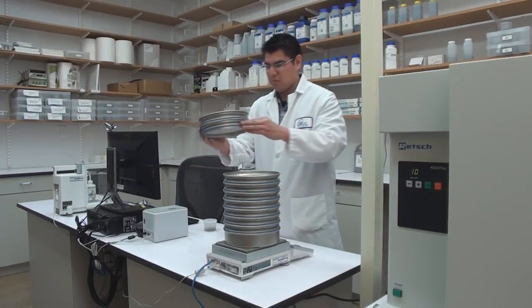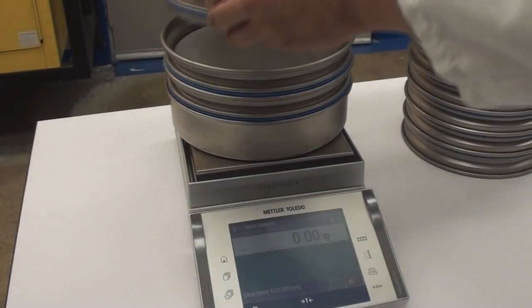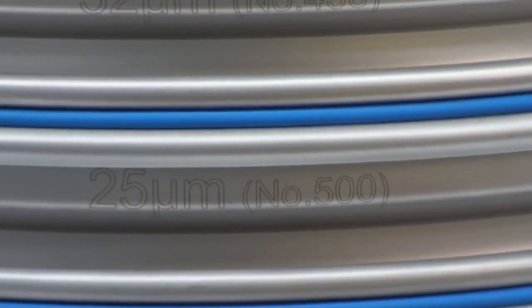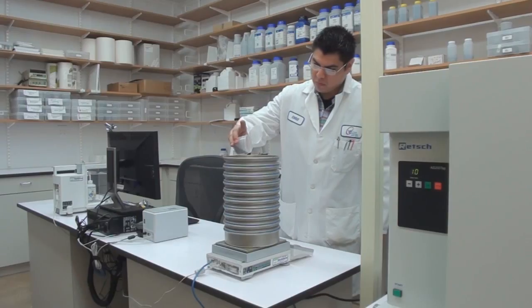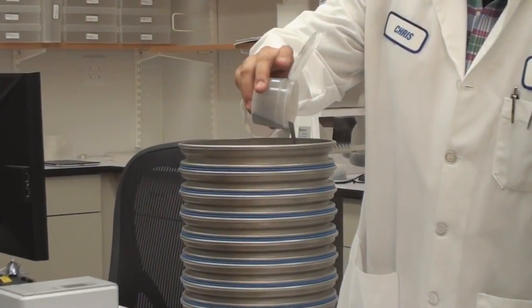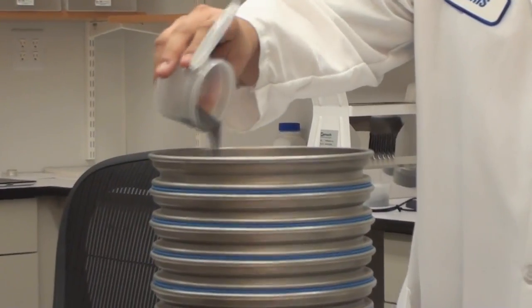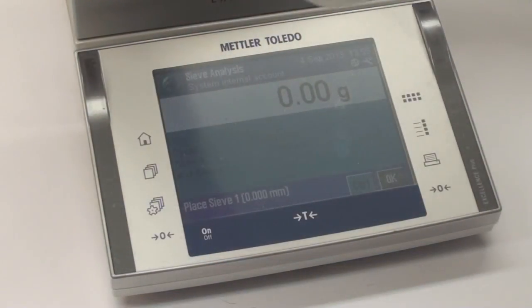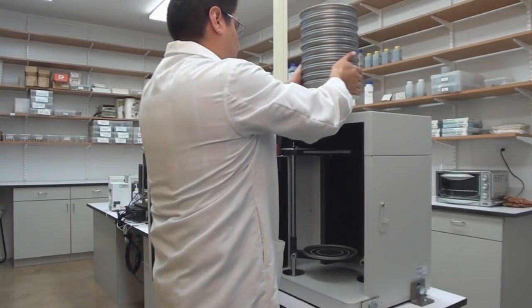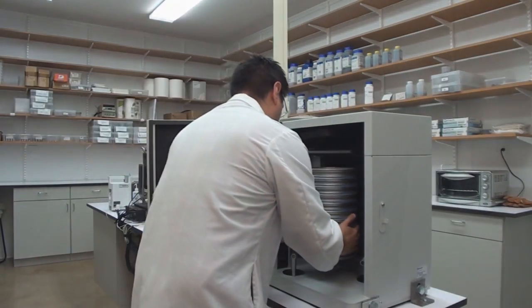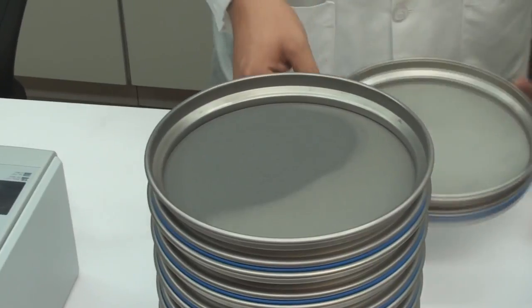We use a process known as powder sieve analysis to determine the particle size distribution of our powders. Particle size distribution of a given powder is important when determining thermal spray capability and fine-tuning spray gun parameters. Once we have established the particle size distribution, our operators can accurately set the optimal distance from spray gun to part. Coarser materials tend to need more time in the plume to heat up versus finer materials which will melt more quickly.